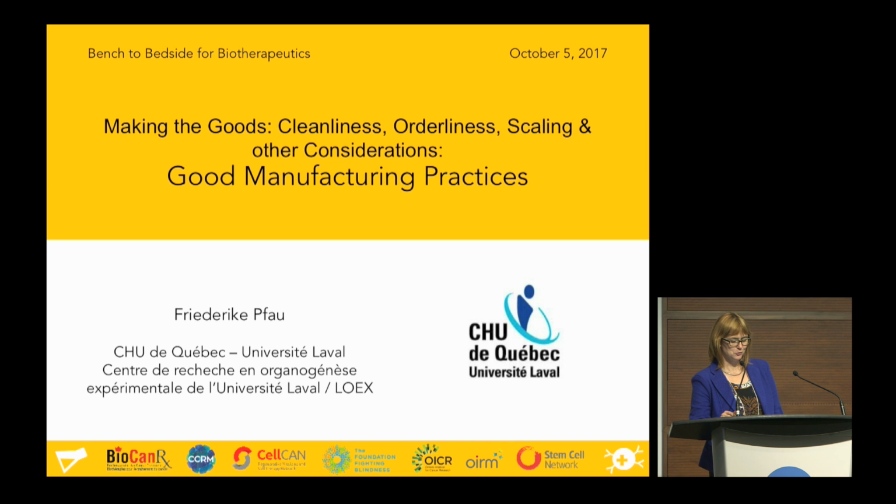I'm the Quality Assurance Manager of the LOEX laboratory in Quebec City. And the clean rooms we have are used for tissue engineering, and we build products such as skin and cornea in those clean rooms for early phase clinical trials, for the autologous use in burn patients and patients with limbal stem cell deficiency.